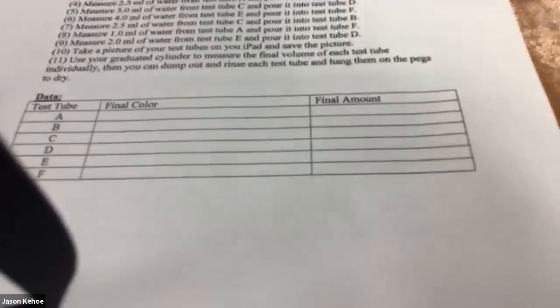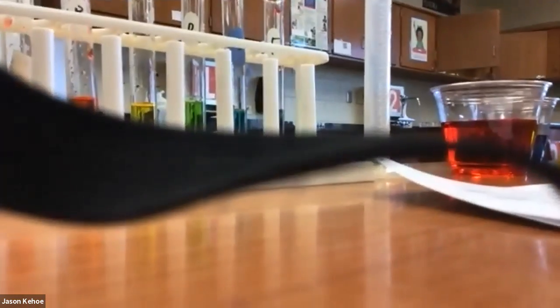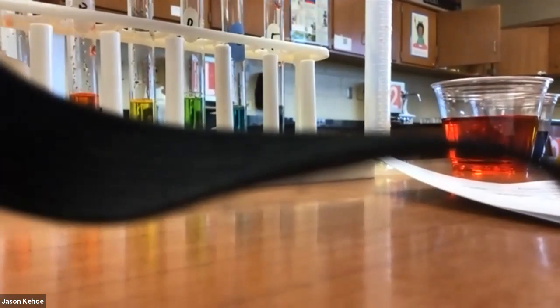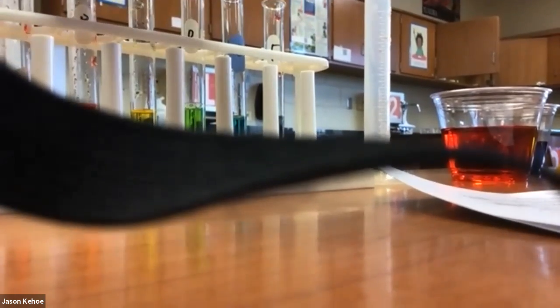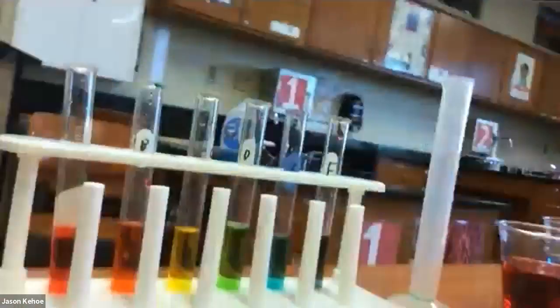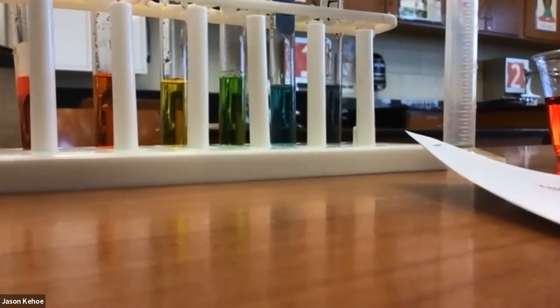All right, and you would fill in the final color and final volume for each of those measurements. So in the interest of time, I'm telling you that if you added up all of those steps, like how much was added into and taken out of each tube, they should be the same.